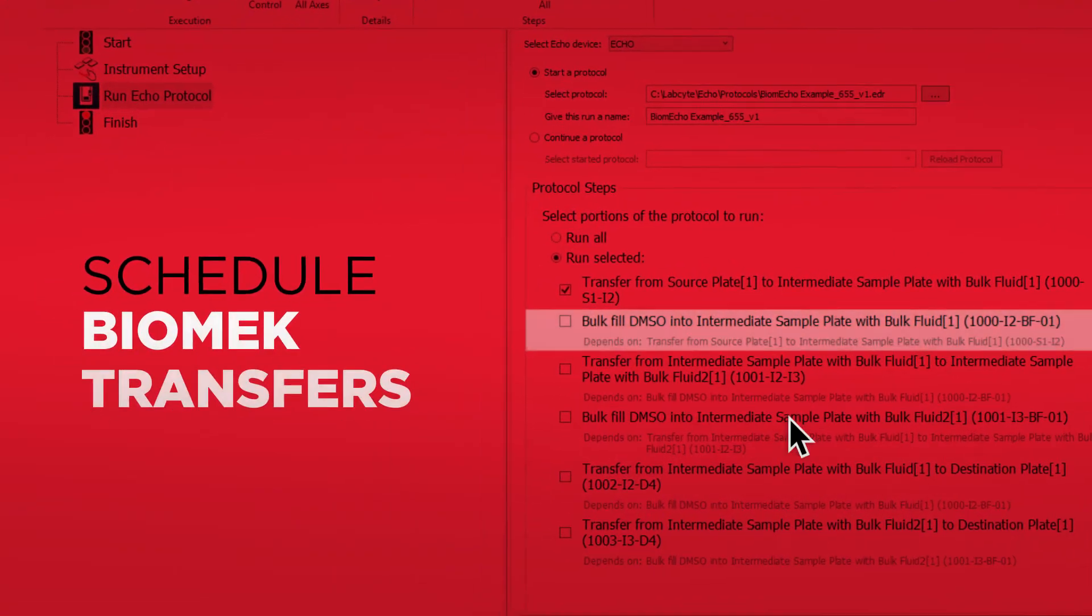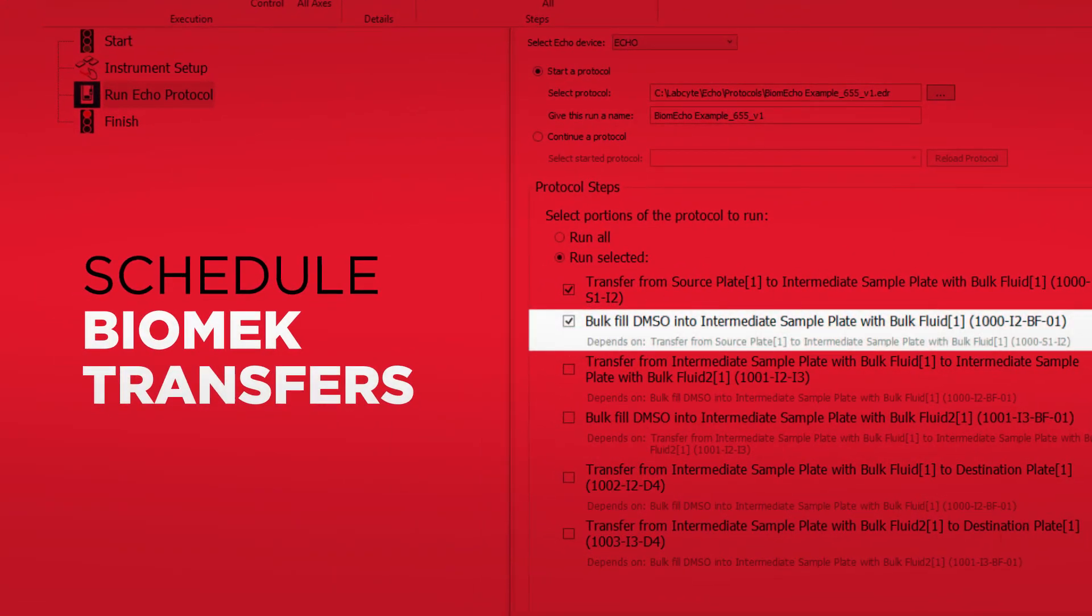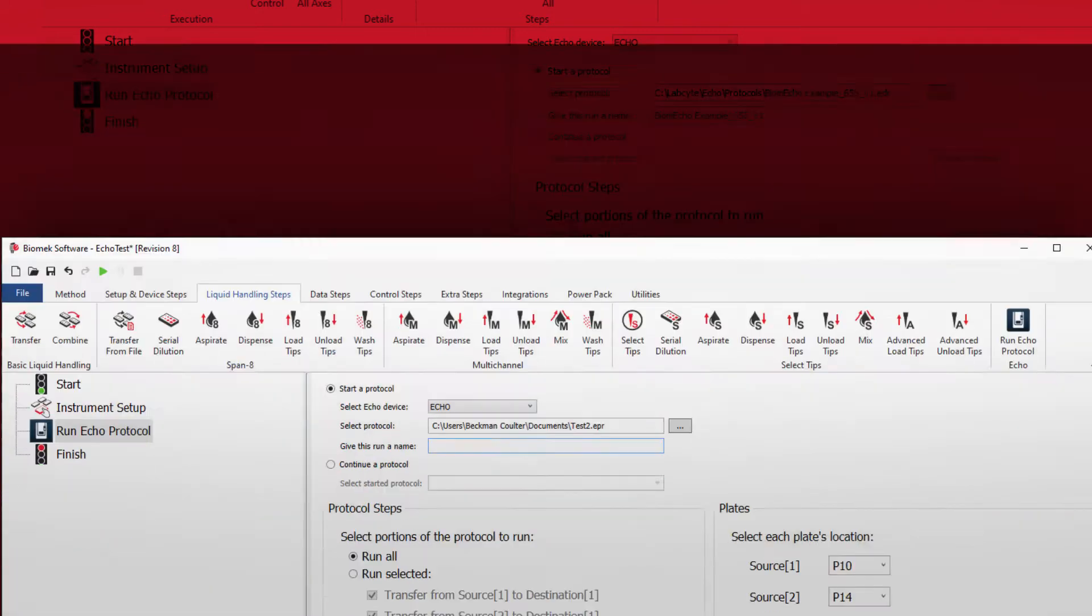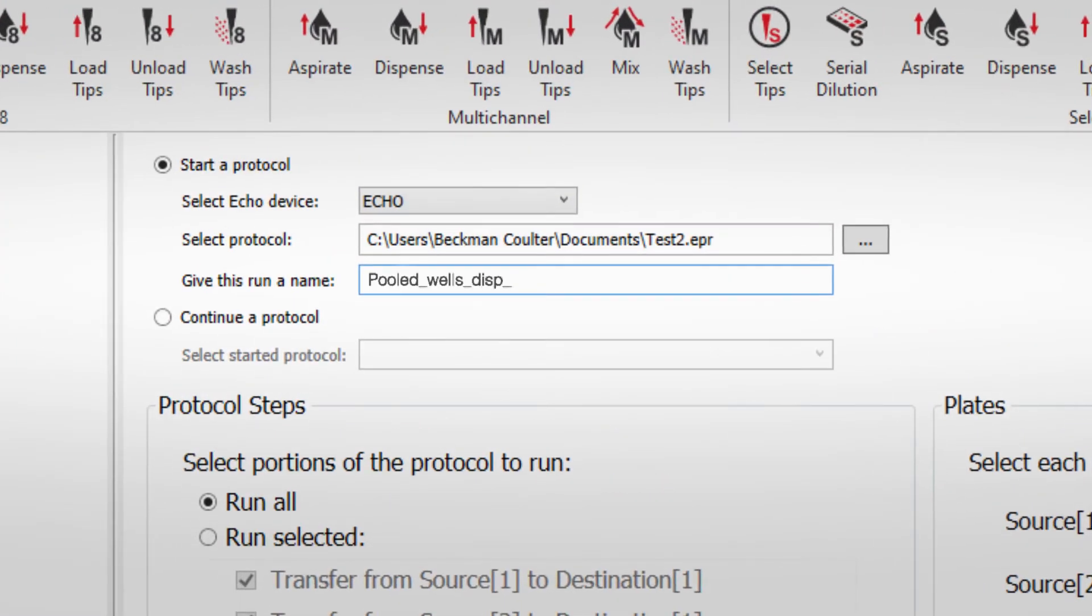Schedule Biomech transfers and other device actions between Echo plate dispenses. All Echo application software features, source well volume, and transfer data can be used in runs.